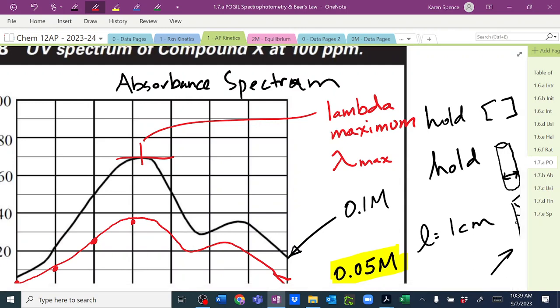So for example, there is a lab where you can take some crystal violet, which is a dye, and you put some bleach in it. And then you pop it into the spectrophotometer, and you take readings every minute or so. And what happens is that the bleach will react with the dye, and it will start to get lighter and lighter and lighter.